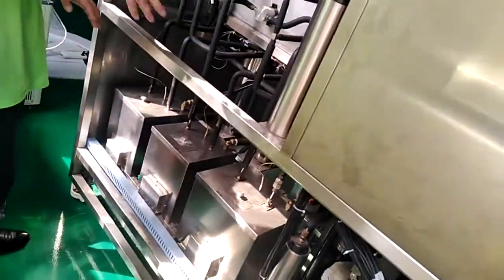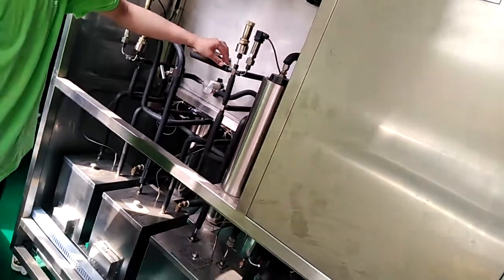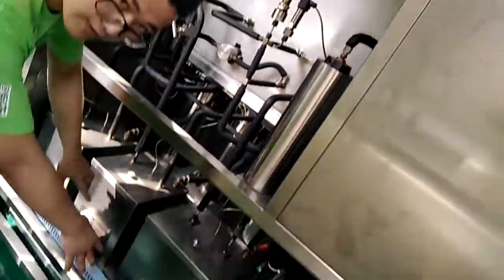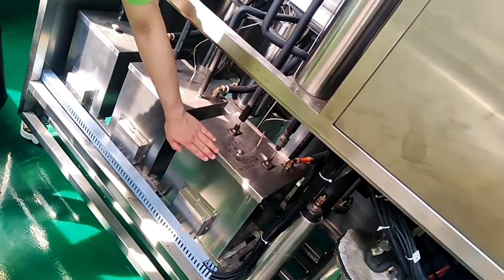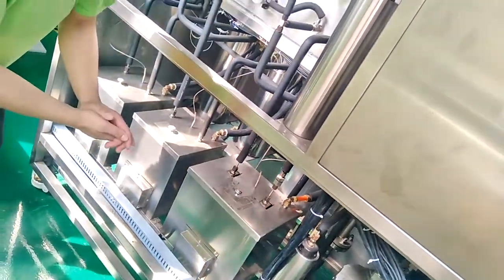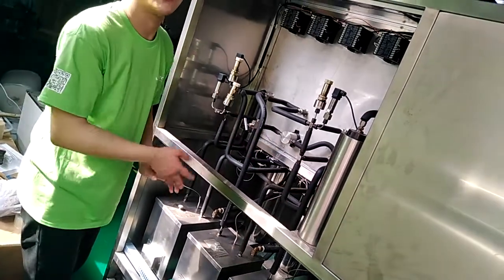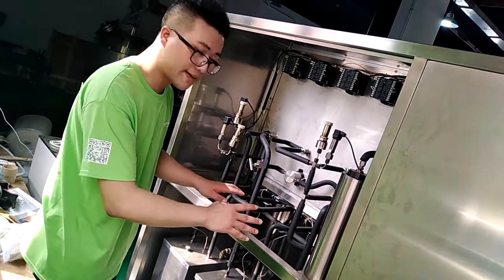Here is the backside of the machine. You can see the pipelines and also the backside of the controllers. And here is a main part — water tanks, we call them water bars. The water is inside. With the help of a water circulation pump, the water will circulate through the jacket of the vessels.